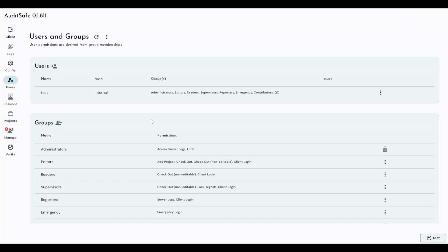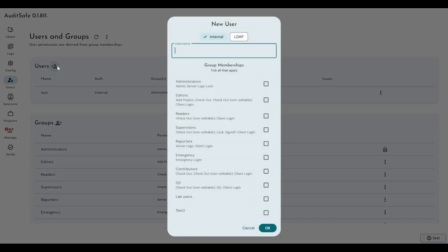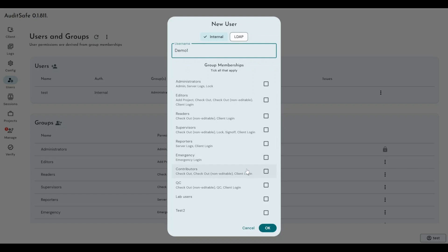And it allows you to infer that if someone is an analyst, you would know what permissions they already have. So, user creation, you would add a new user, give them a username, say demo1, and you would tick which group you want them to be a member of. Now, users can be members of multiple different groups and they can also be members of custom groups that you've created.